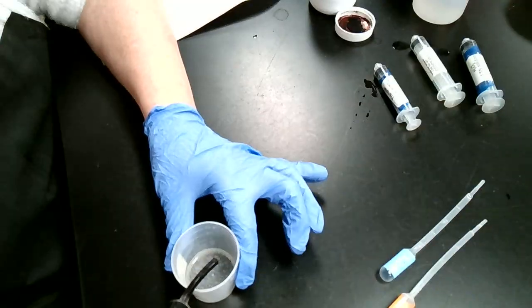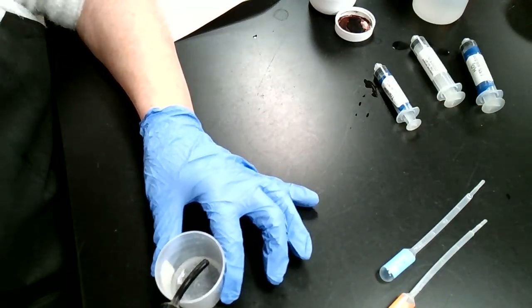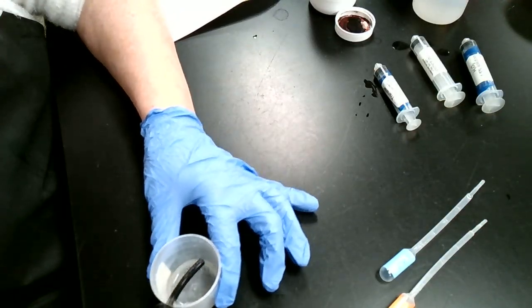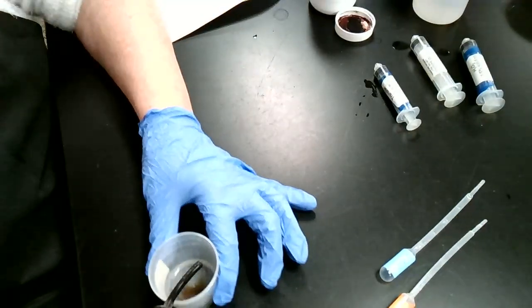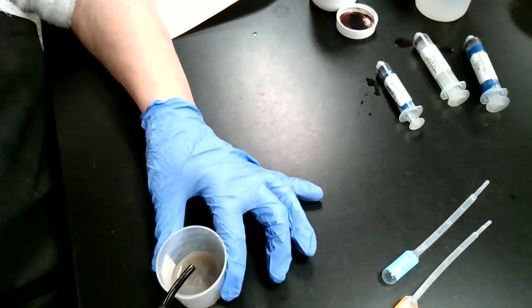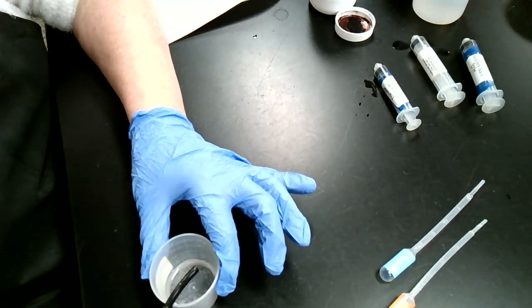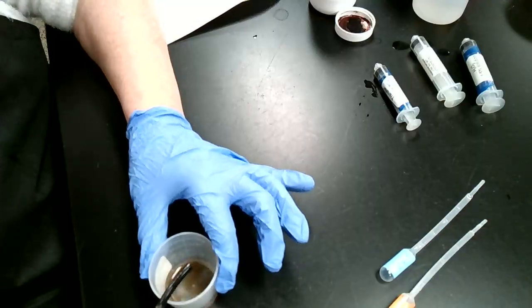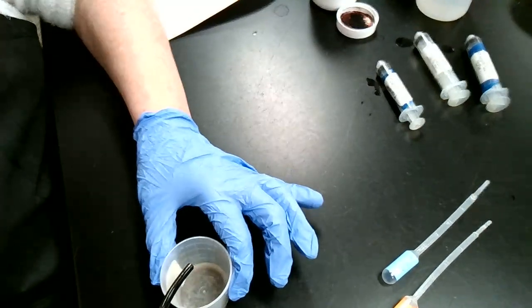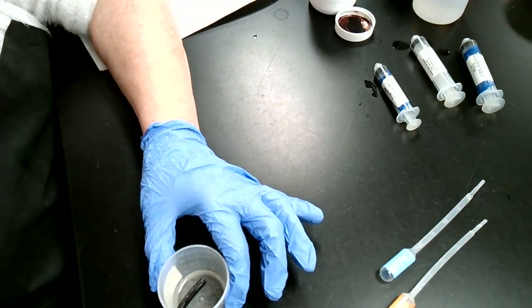Ooh, that was close. It almost stayed that time. Let's do the next drop. Still didn't stay. Next drop. Still didn't stay. Next drop. So this might take a while. Let's hope not. Oh, it's getting close to staying. Not quite yet, though. It's getting closer. Once this color remains, okay, that was real close this time. Might be just one more drop here or something.